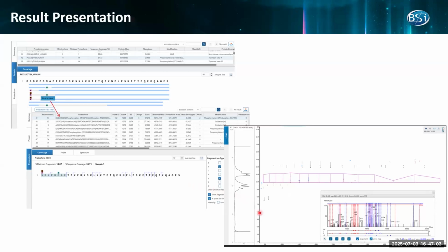For example, from the feature perspective, you can see those are proteoform features, and this is an example of an antibody. They have light chain and heavy chain. You can see this is a light chain proteoform, and they have different charges. They will group together. There are some tandem spectra that give you the sequence information. And if we put all those together, you can see we will have a protein and proteoform with top-down information.